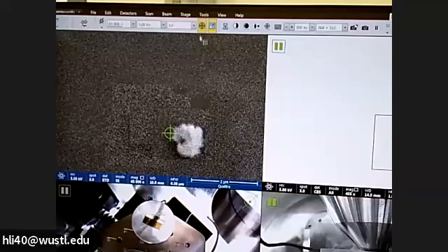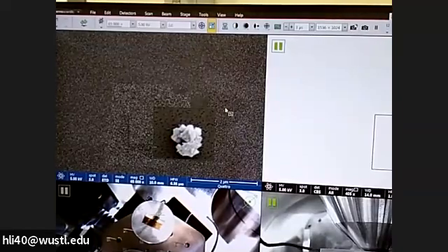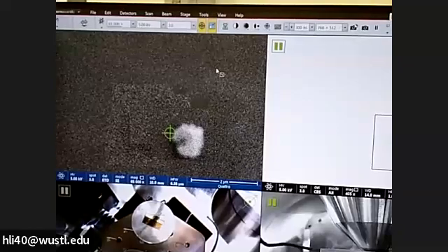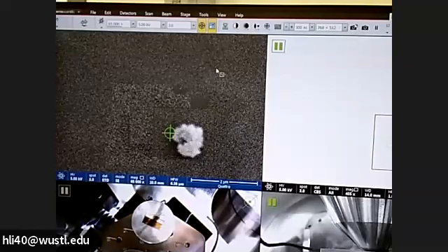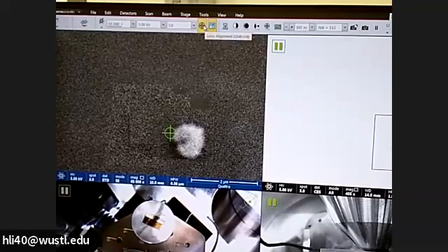Which is around here. After this, we click this wobbling off. We will need to adjust the focus a little bit. And then we adjust stigmatism again to make the image as sharp as possible. Okay, this is good. We can check the wobbling again. You'll see it's almost staying there, no jumping. Okay, this is good enough for this purpose at the moment.